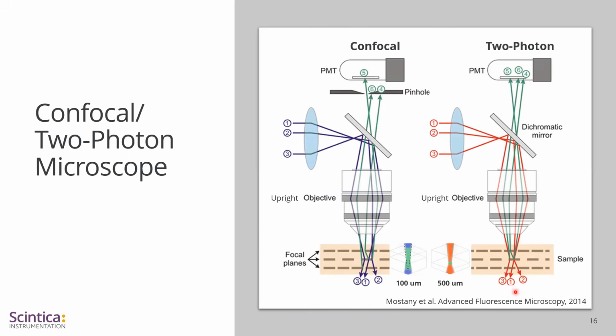In contrast, a 2-photon microscope does not require a pinhole, since all the emitted photons contributing to the signal come only from the focal point of the excitation spot, regardless of how much they scatter on their path to the detector. Greater tissue penetration up to 500 microns is reached with 2-photon microscopy, and fewer excitation events are required to achieve the same signal due to the improved collection efficiency, limiting potential photo damage in this technique.